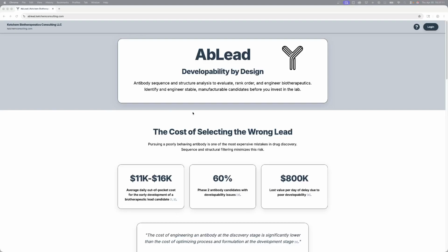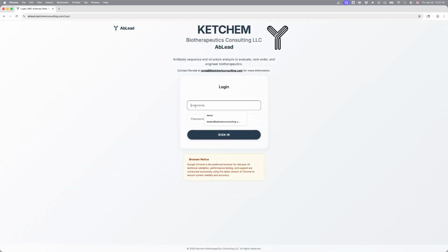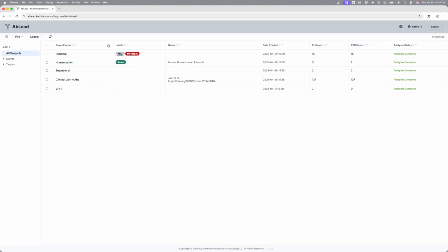Welcome to my second video of an overview of AbLead, an antibody lead analysis, selection, and developability engineering software platform. I'm going to log in to the platform as a demo user, and I'll jump right into an entry.